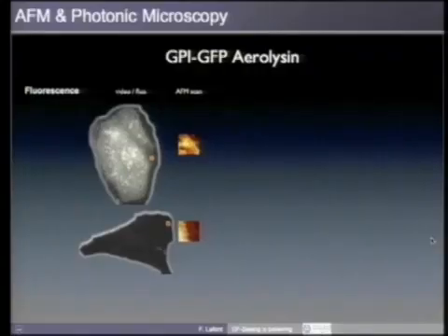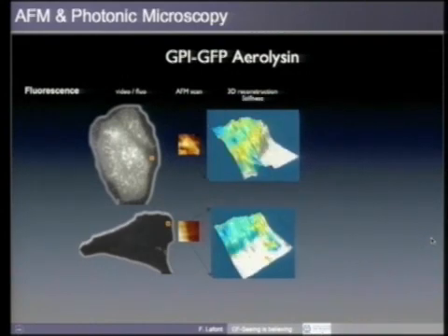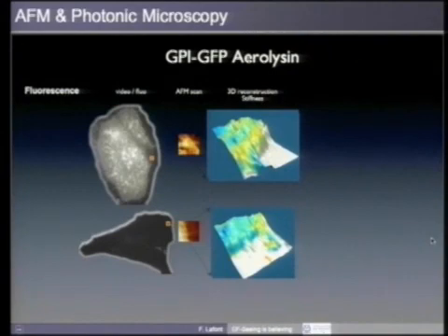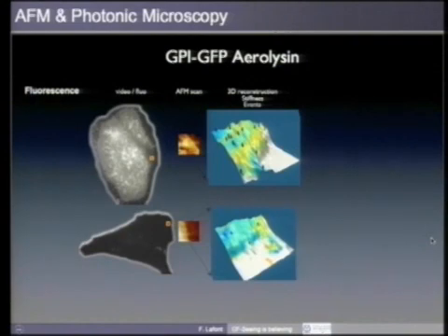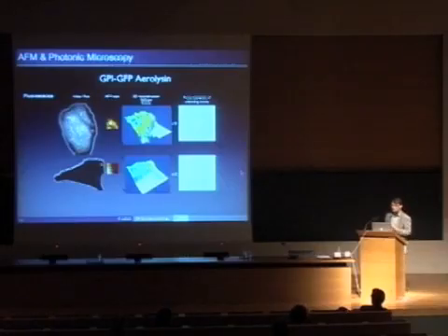And now what we will get as information will be first the topology with nanometer resolution in the z-axis. Then we will get information about the stiffness of the sample. And since we've coated on the tip this toxin that will recognize those proteins, we can map the distribution of these proteins at the cell surface. And of course, here we have much more because we overexpress the protein. But on top of that, we can also obtain the interaction forces.